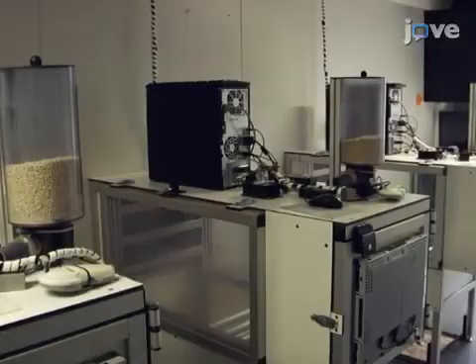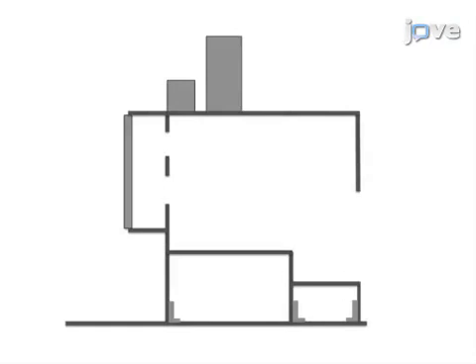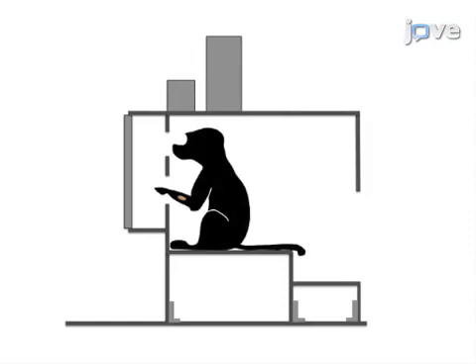To begin, prepare the test chambers. Equip a test chamber with sliding doors at the rear that can be open or closed. Open the back door of the ALDM unit to provide access to the test system from the enclosure.